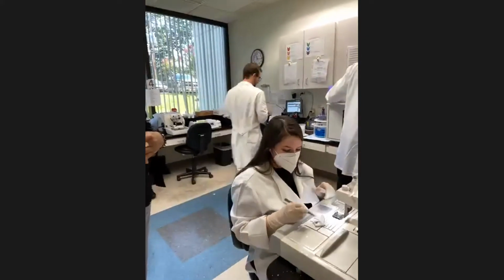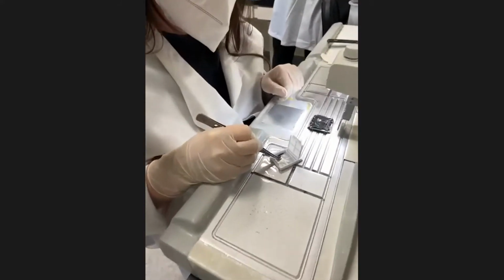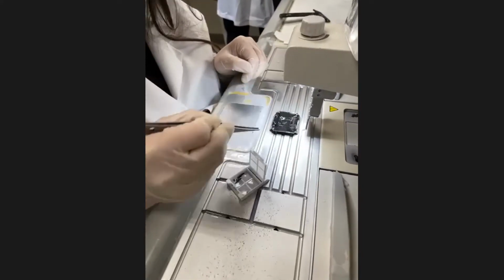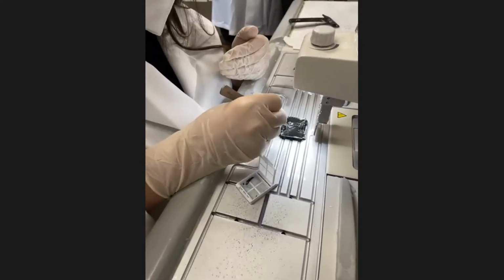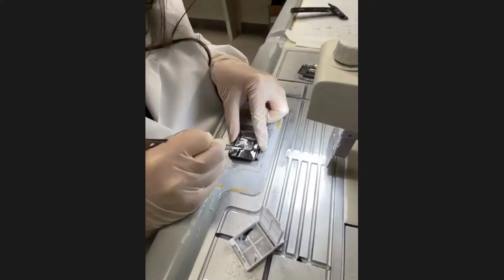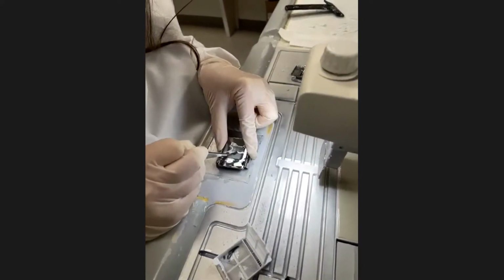So what I'm doing is, I'm being careful to expose my tissue from the cassette, and I will transfer it over into my mold. And then I will place it at a 45-degree angle so that it ensures easy access, easy cutting for the tech. And then I will move it over to the cold plate, and I will apply pressure so that it is on an even plane for the tech to ensure cutting.